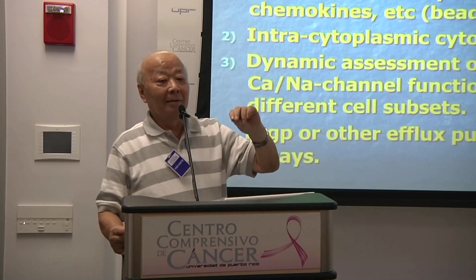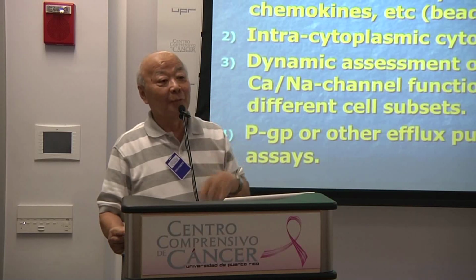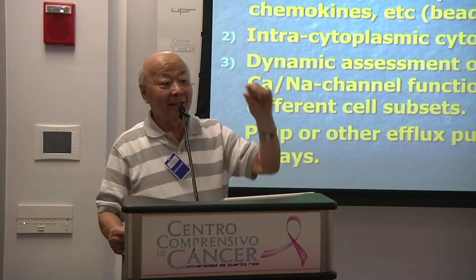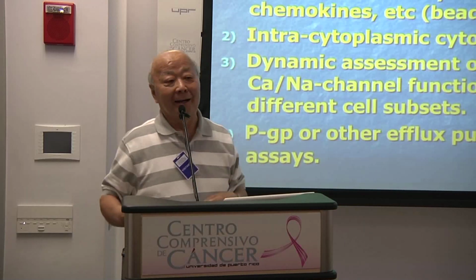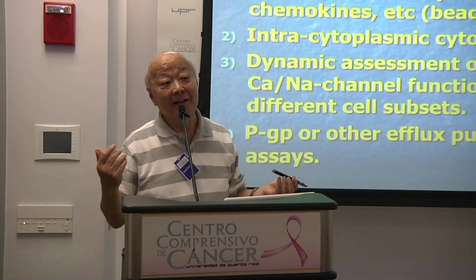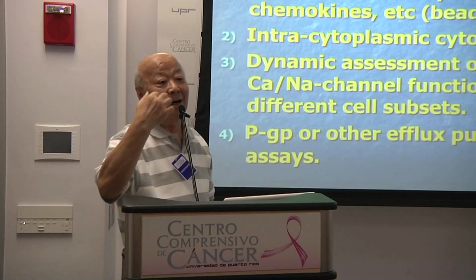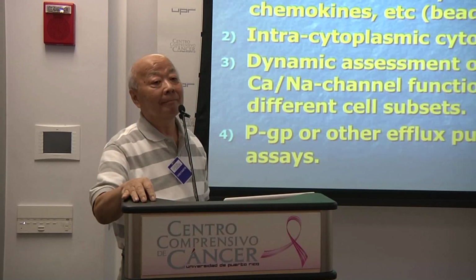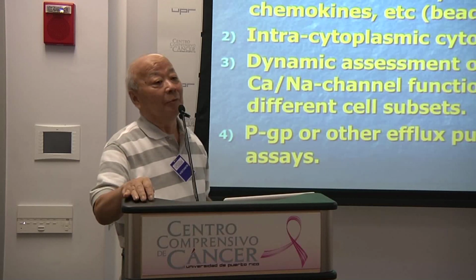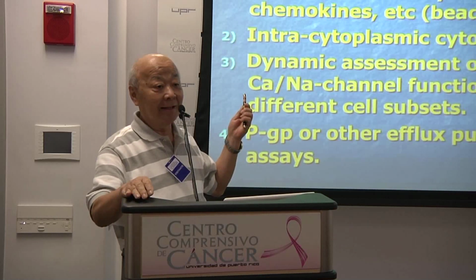Because you have to have at least 1 or 2 copies of template in the reaction mixture. And we use 20 microliter, 10 microliter template. So without concentration, we can go to probably hundreds.